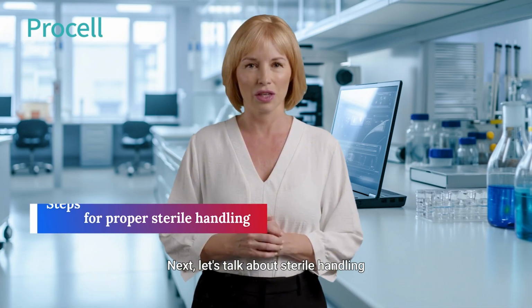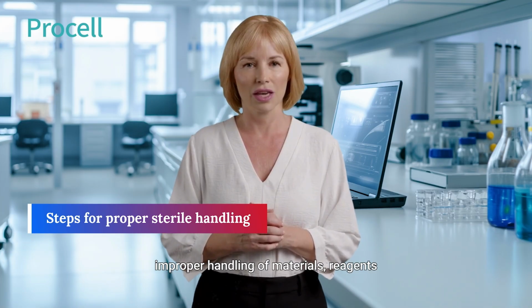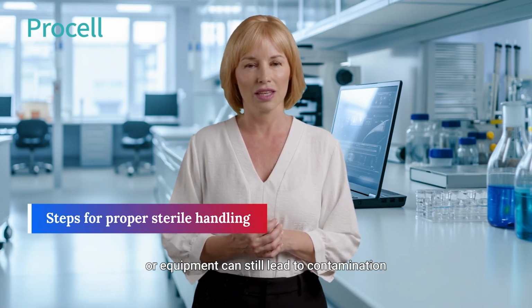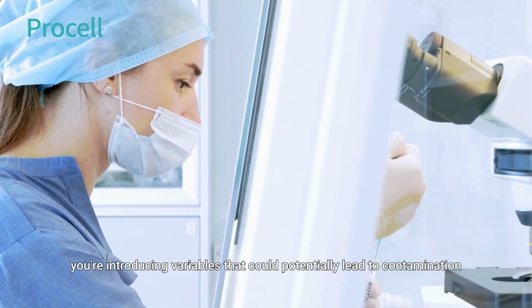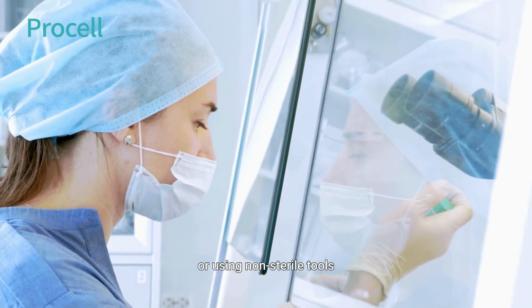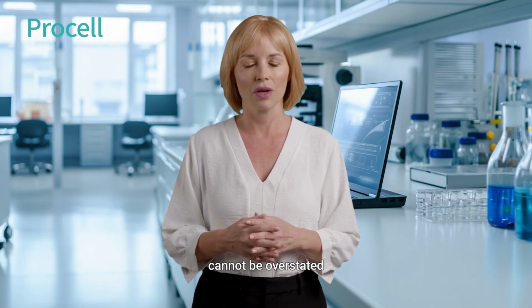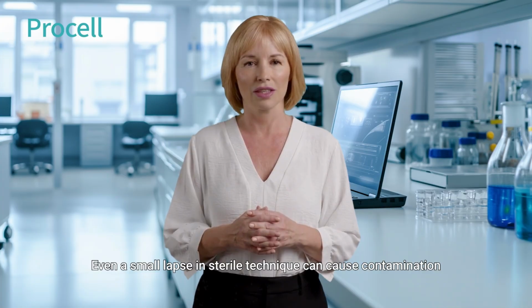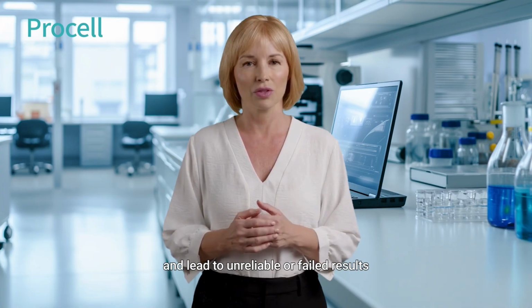Next, let's talk about sterile handling. Even if your work area is spotless, improper handling of materials, reagents, or equipment can still lead to contamination. When you handle materials, you're introducing variables that could potentially lead to contamination. For example, touching the inside of a container or using non-sterile tools can transfer microbes directly into your cultures. The importance of using sterile tools such as pipettes, pipette tips, and other lab instruments cannot be overstated. Even a small lapse in sterile technique can cause contamination and lead to unreliable or failed results.